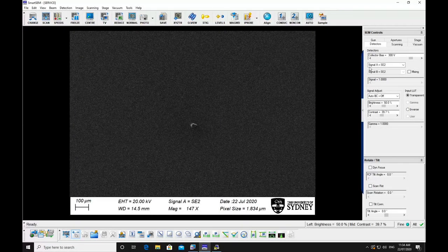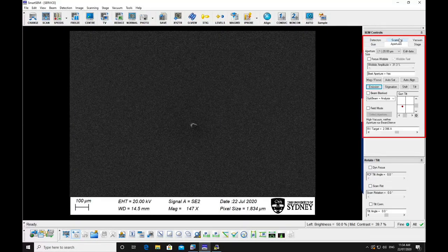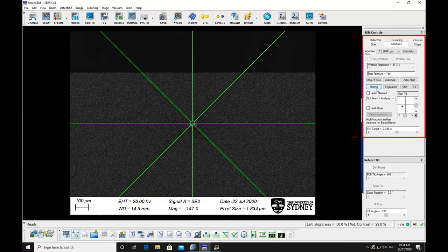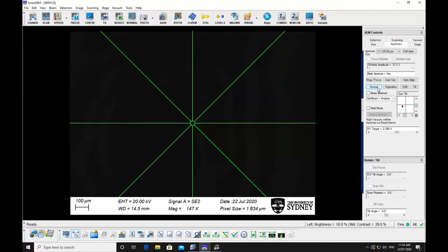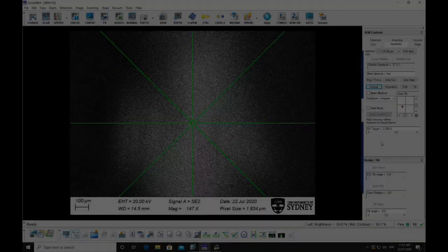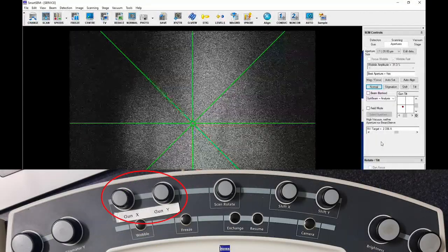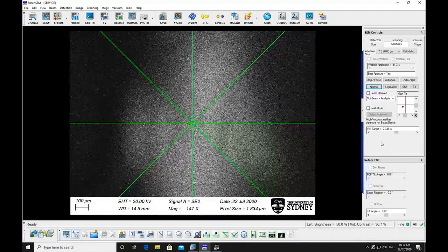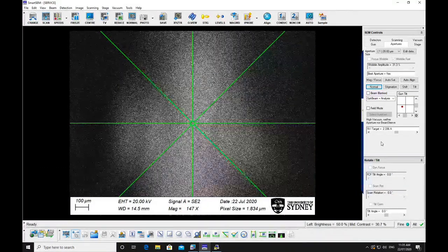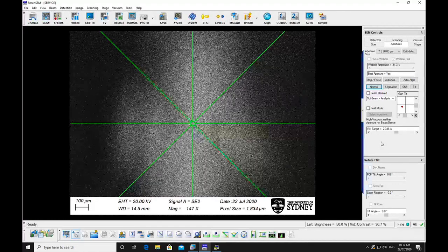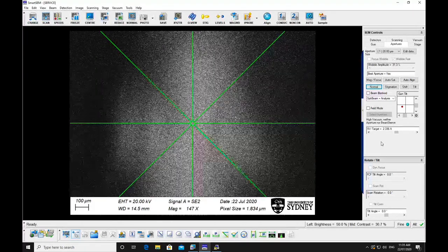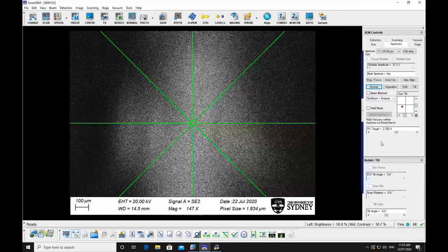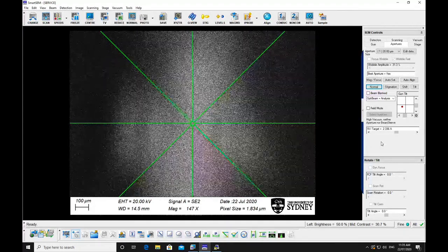Check the gun alignment. Go to the Apertures pane and click the emission button. You should see a bright region. This is the emission pattern. Use the gun align knobs on the hard panel to bring the emission pattern to the centre of the screen. Alternatively, turn off field mode and use the gun shift until the image appears to be the brightest. Return to normal imaging mode and adjust the brightness and contrast again.